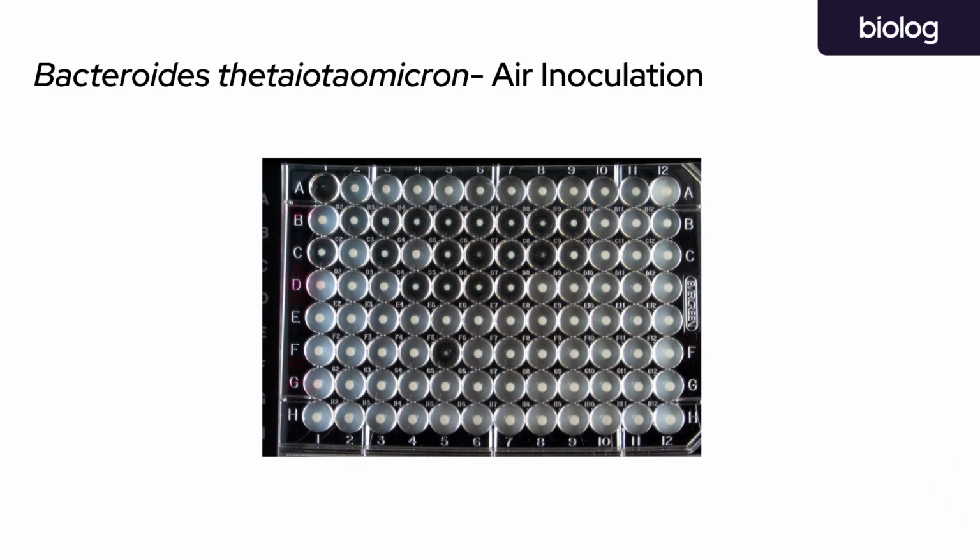Here we have the same strain inoculated on the same plate, only this time it was brought out into the air during the inoculation step for just a few minutes. And the reason we did this was to model a situation where maybe you don't have access to a chamber, and so you're incubating in a box with an oxygen absorber. This small exposure when the box was opened, for instance, led to a significant growth variation across the plate, where all the wells should be identical, just like on the last slide.